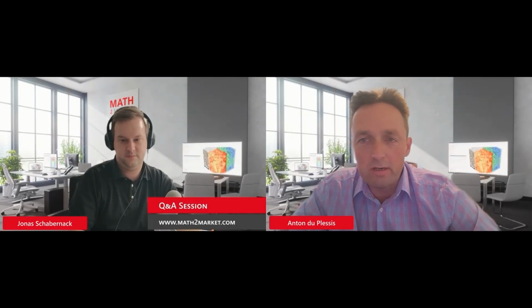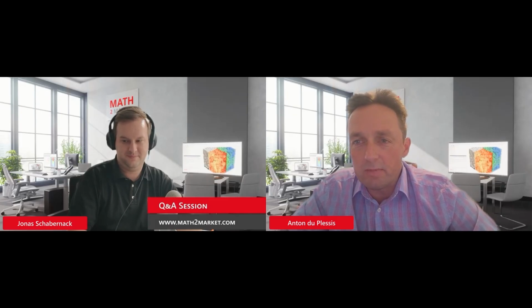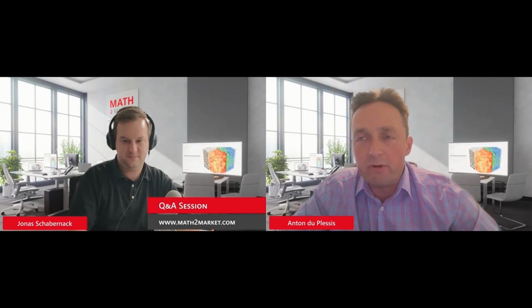All right, we have another question. Thanks for the presentation. Because I use the Dragonfly software for the CT data, I wonder what is the major difference. It's a good question. It's not our aim to compare with other software here. All software has benefits and strong points and differences.